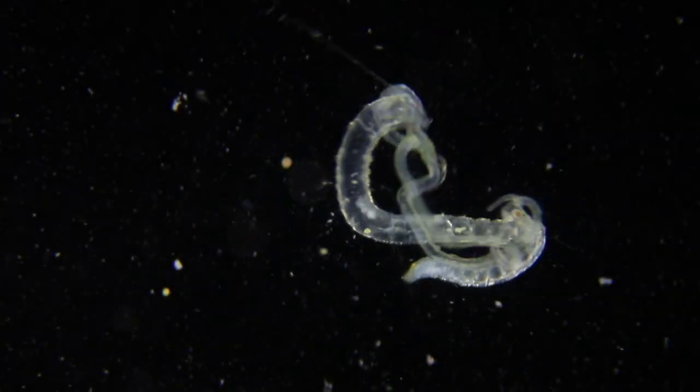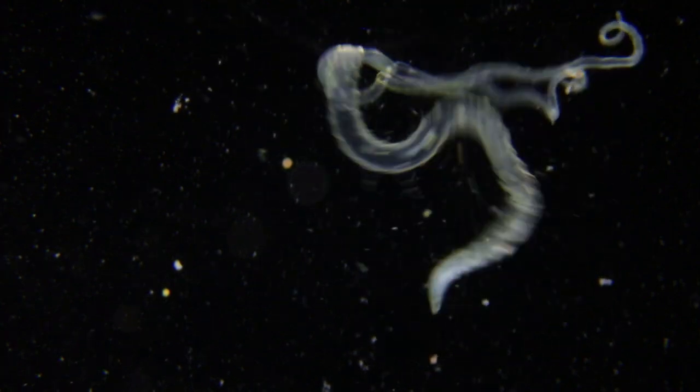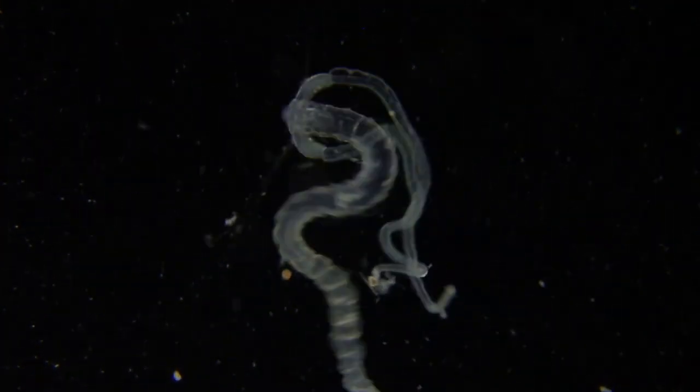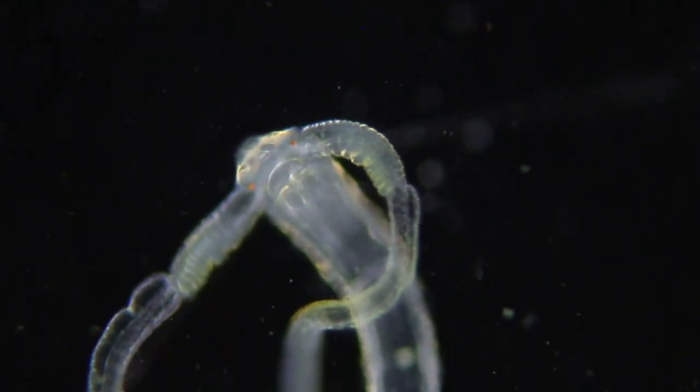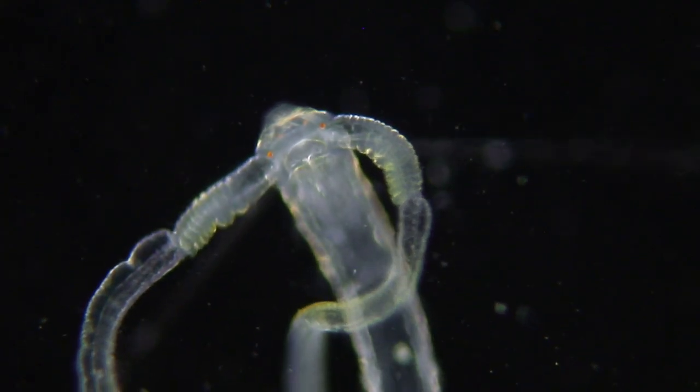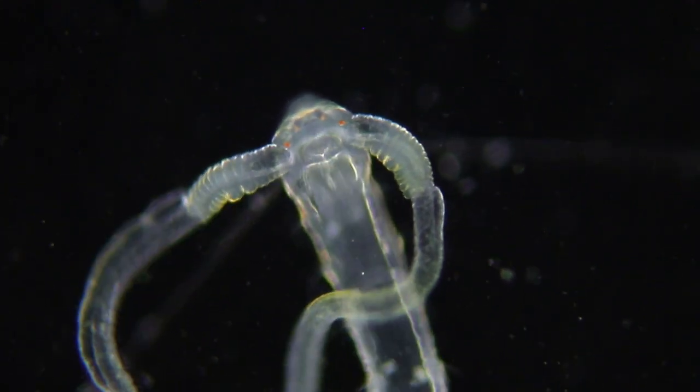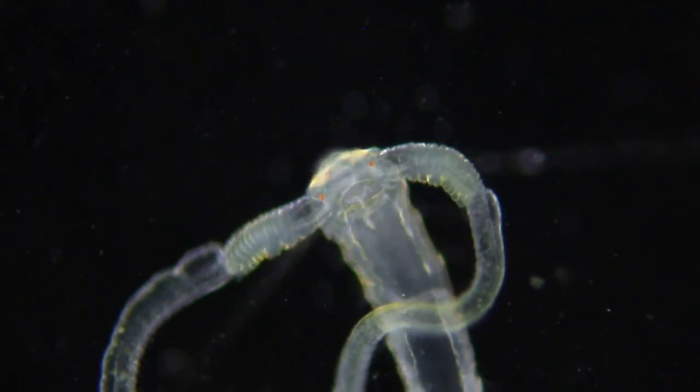One last polychaete worm, this one from the Magelonidae family. It has long feeding tentacles, also called palps. And there is its proboscis.